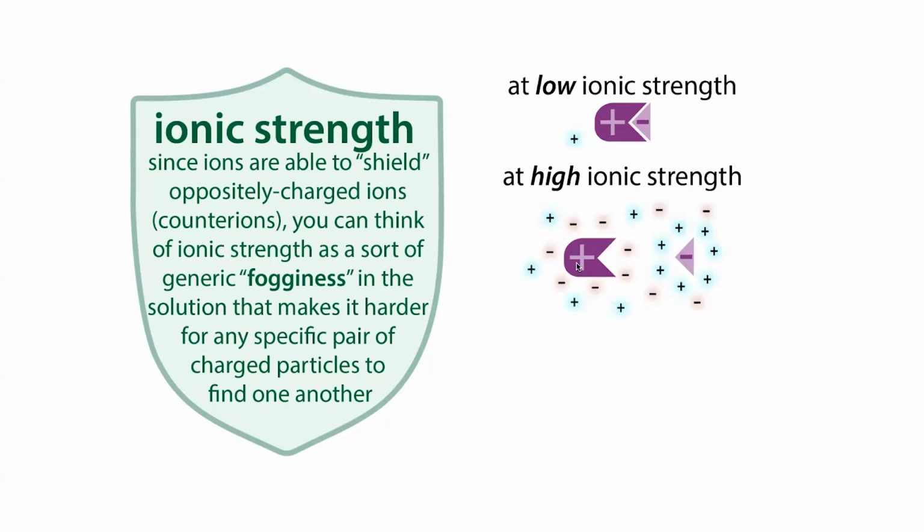And so they're going to be binding to the salts, binding to these ions instead of binding to one another. So the higher the salt concentration, the higher the ionic strength, the stronger the interactions have to be in order for them not to be broken up. And so if you want to increase the harshness of your wash, remove some of those non-specific binders, some of those weak binders, you often increase the ionic strength, you increase the amount of salt in your solution.